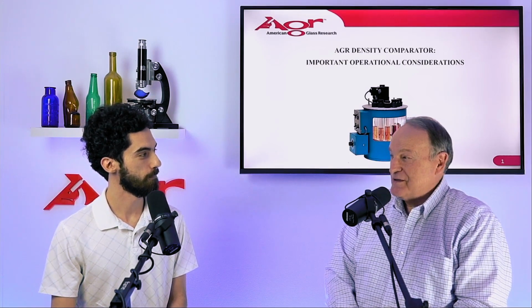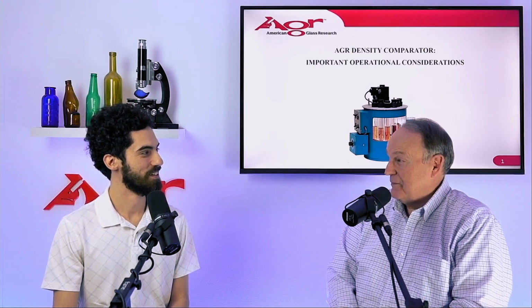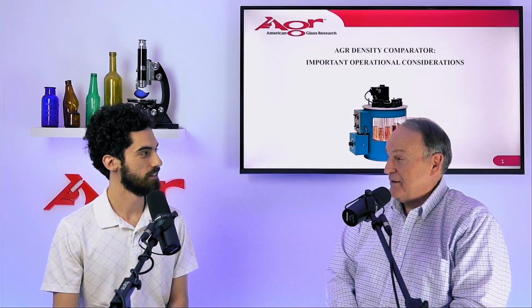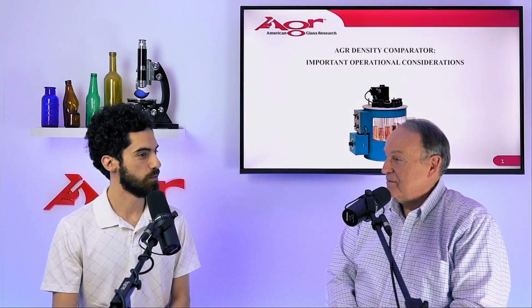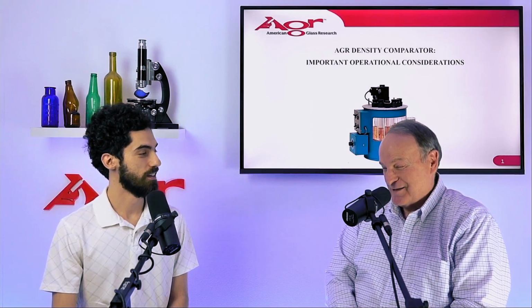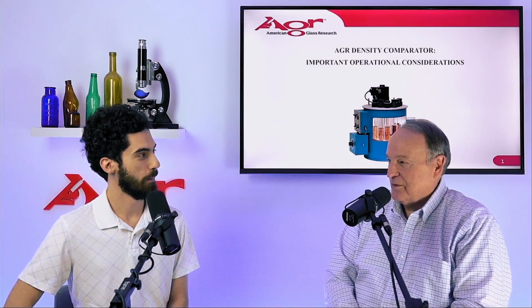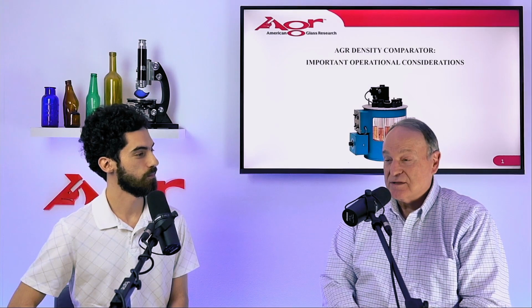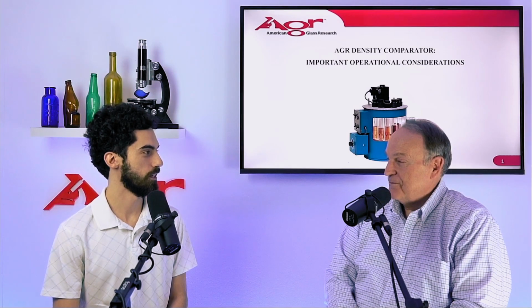In the old days, they used to do glass composition by wet chemical analysis, which was time consuming, and it didn't provide the data they needed on a regular basis quick enough. How long did it typically take? Oh, maybe 2 or 3 days. We're talking days. Yes. And glass composition has a very important role to play in the manufacturing of bottles because it does affect various properties of the glass. Of course, it's the foundation.